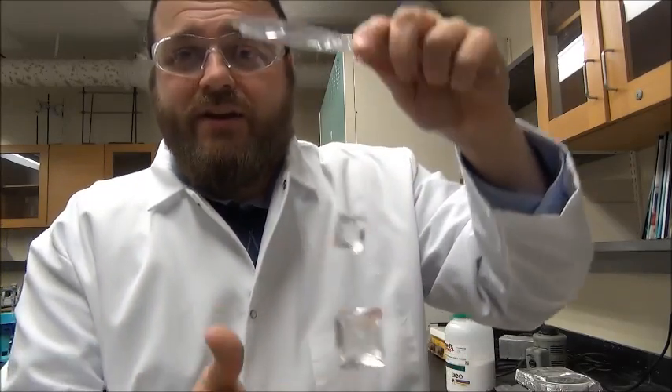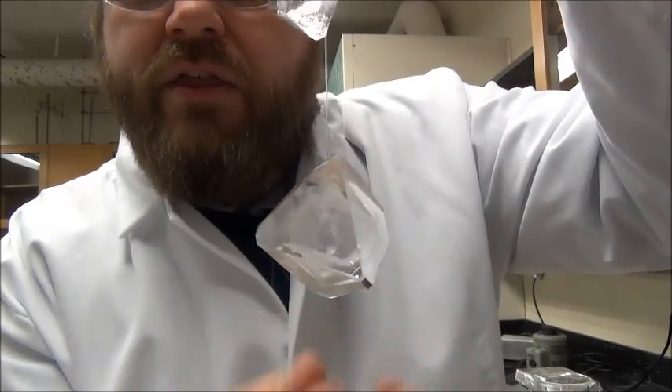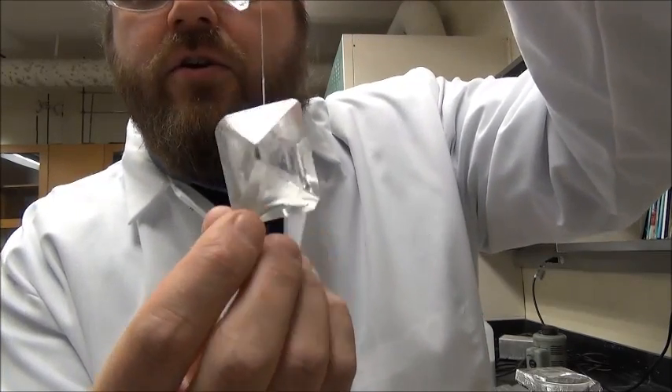In the first video, we're going to show you how to grow a seed crystal. You can actually see the seed crystals on the inside there — that's what we started out with. And then the second video is going to show you how to take those seed crystals and continue to grow a very nice, large, single crystal.